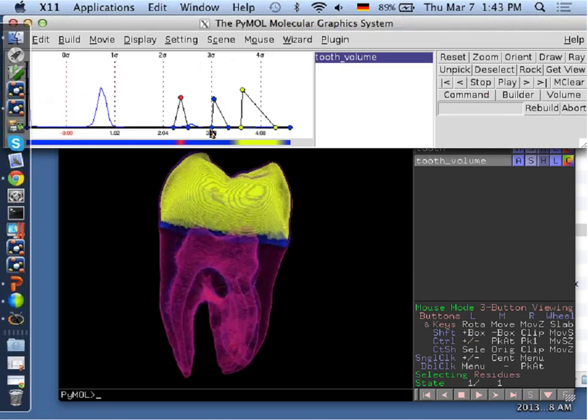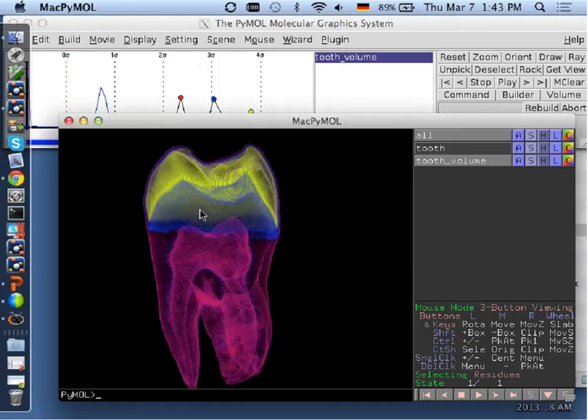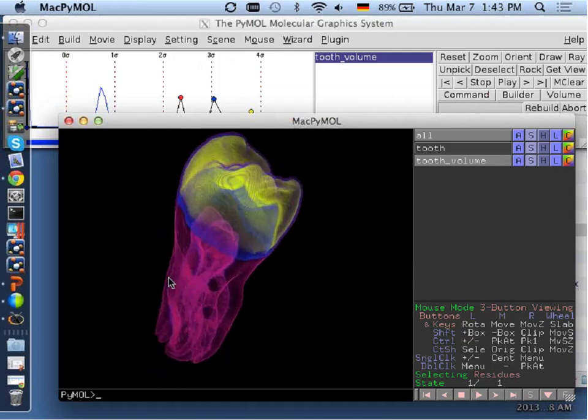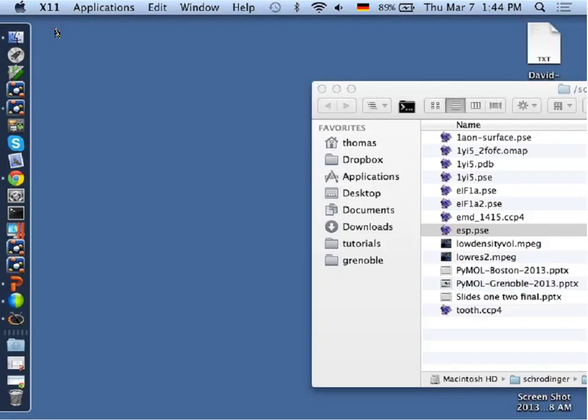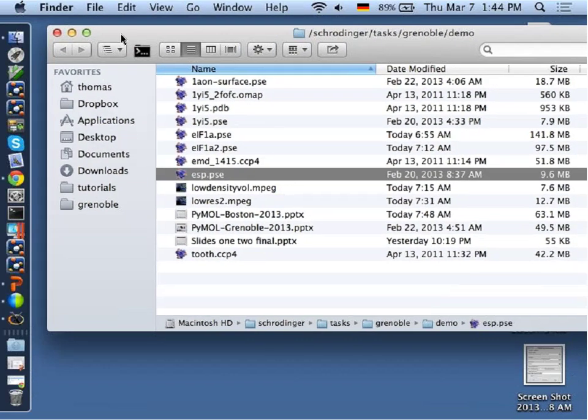And you can also see, because this is all transparent, we can vary the transparency. We can again see how far the underlying density features reach, where the high density starts. So you can easily explore by putting the colors into the volume editor. You can really explore the map in 3D. So that's it for volume rendering. Let's move on to movie making.